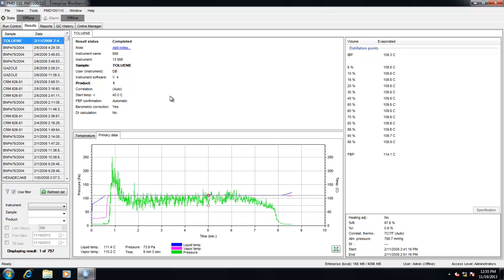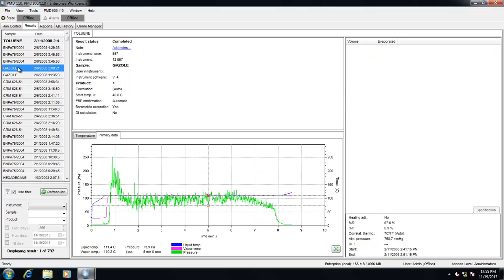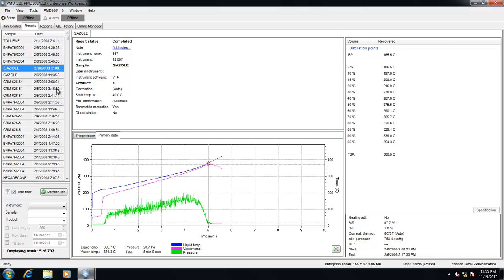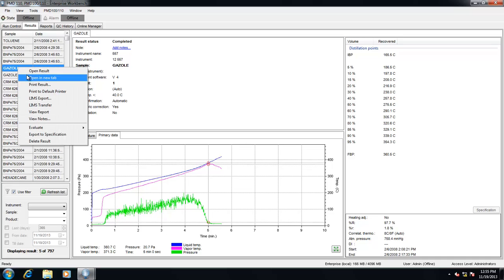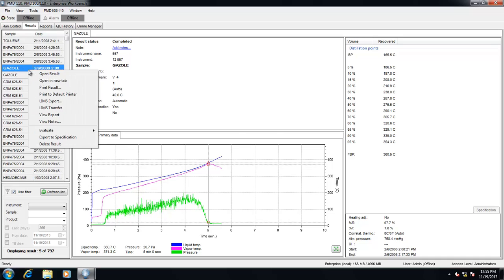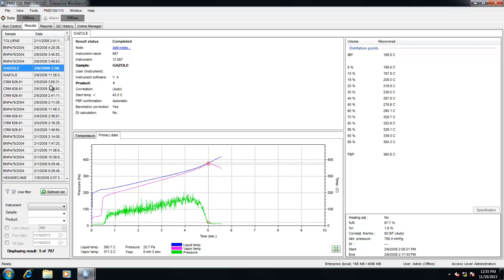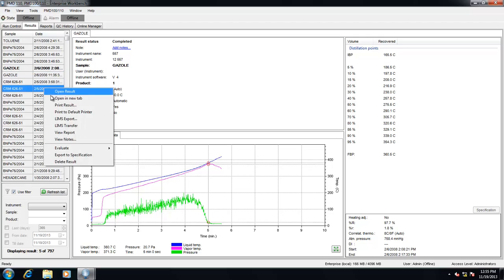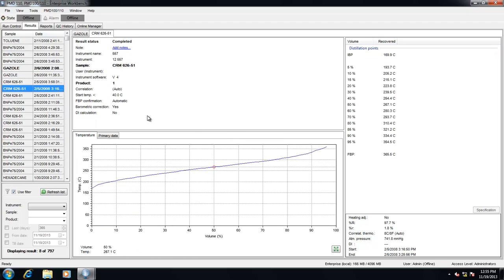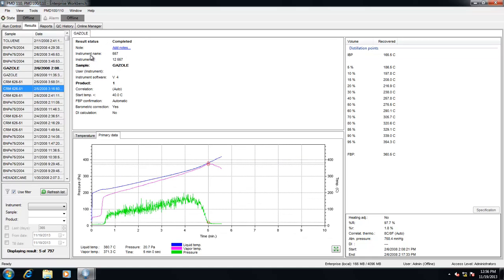If the user wishes to see an additional result, they can double-click the result to open a new window, or they can right-click and open the result in a new tab. To close the tab, right-click the tab and hit close.